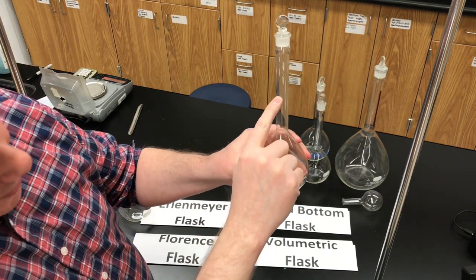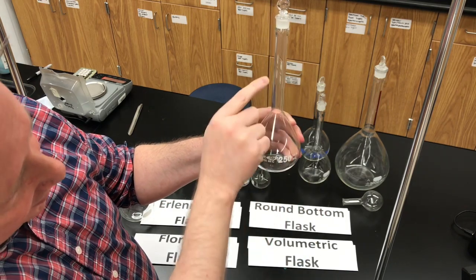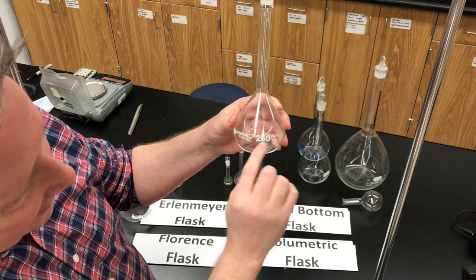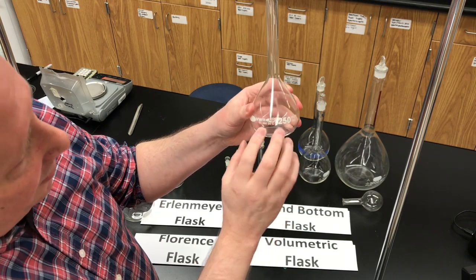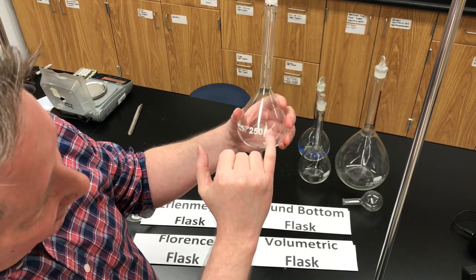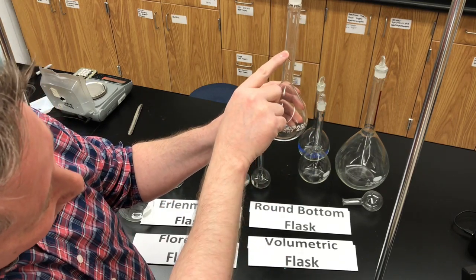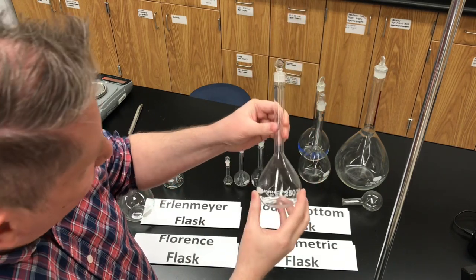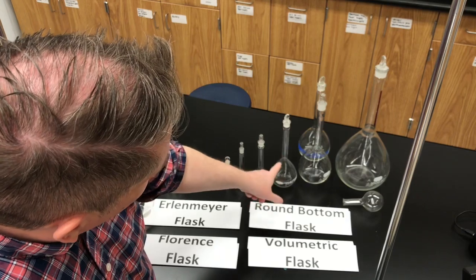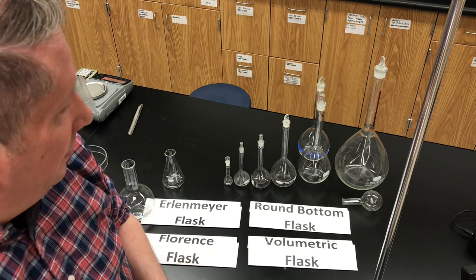On that neck there will be just one line that goes all around the neck. When the flask is filled so the meniscus of the liquid inside is touching that line, you have exactly the volume mentioned on the flask — in this case 250.0, or 250 plus or minus 0.24 milliliters for this particular flask. That's the volumetric flask: characteristic shape, tall round base with a long neck. The volumetric flask is the one we would use to make solutions of known concentration.